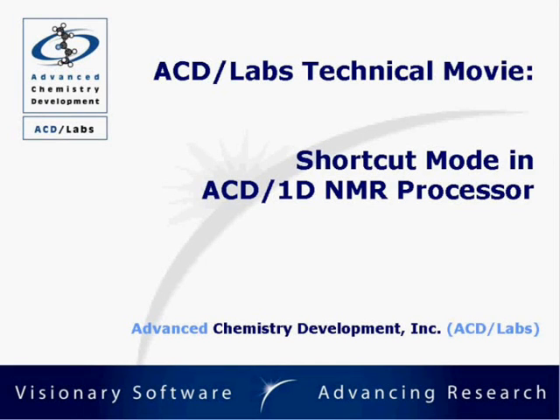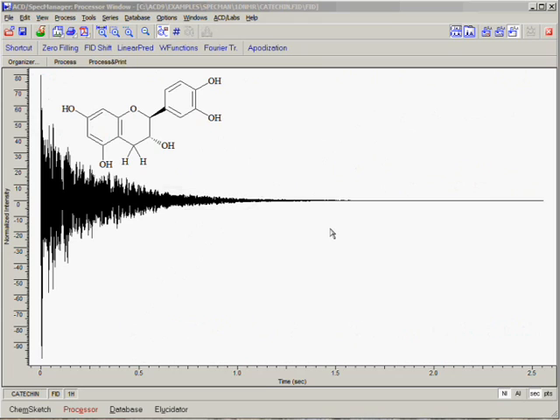Welcome to the ACD Labs technical movie that illustrates the use of Shortcut Mode in version 10 of ACD 1D NMR processor. Shortcut Mode was designed specifically to make the manual preparation of 1D NMR spectra faster and easier for end users who do not require advanced functionality.